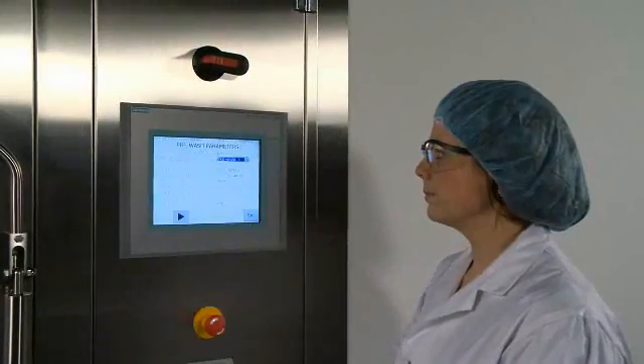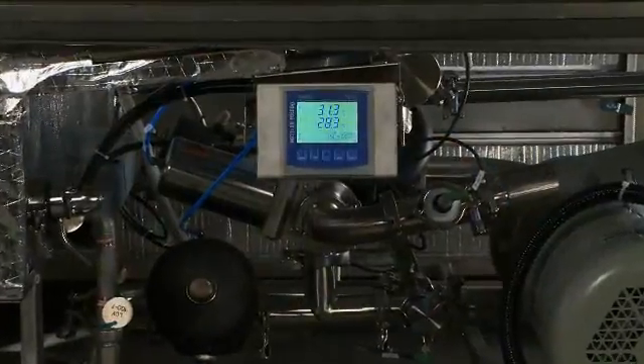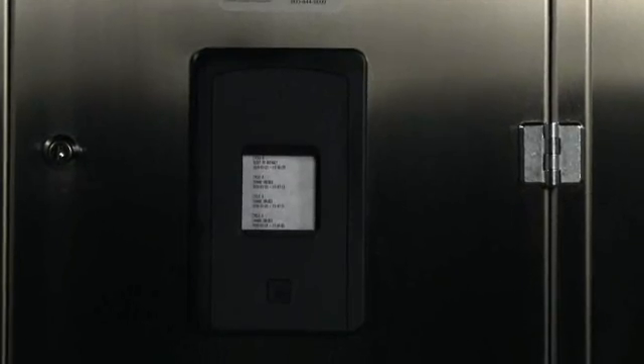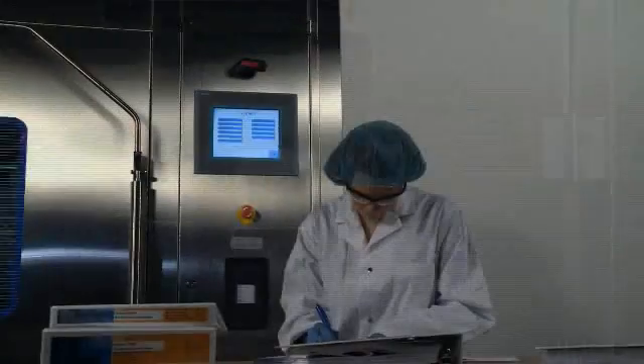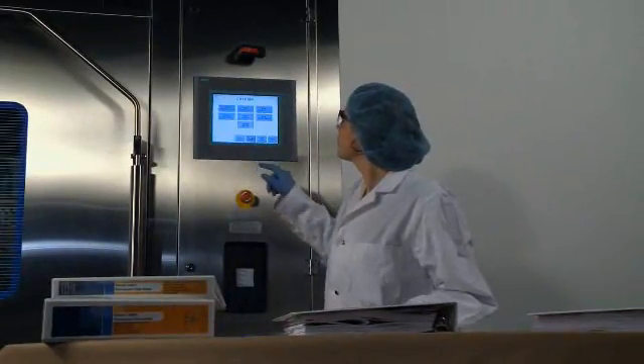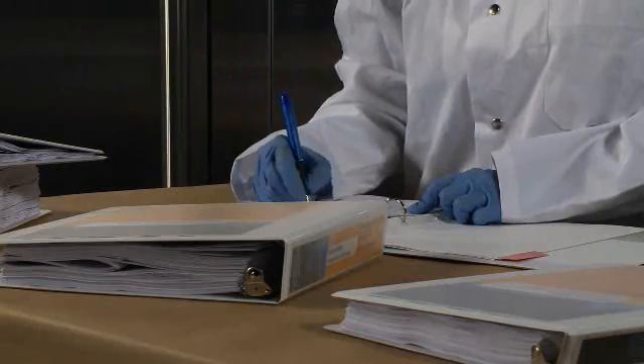The Steris PG series of washers were designed to constantly monitor all critical washing parameters, making validation easier. Process documentation can be recorded on an integrated printer or downloaded to an external computer. Complete design, manufacturing, and qualification documentation is provided to facilitate and accelerate on-site qualifications.